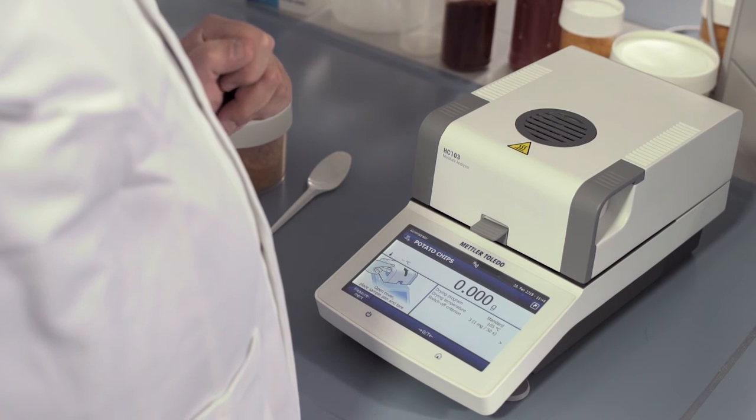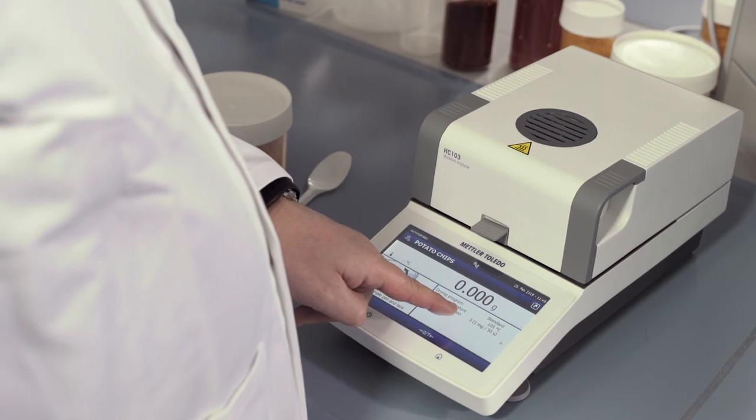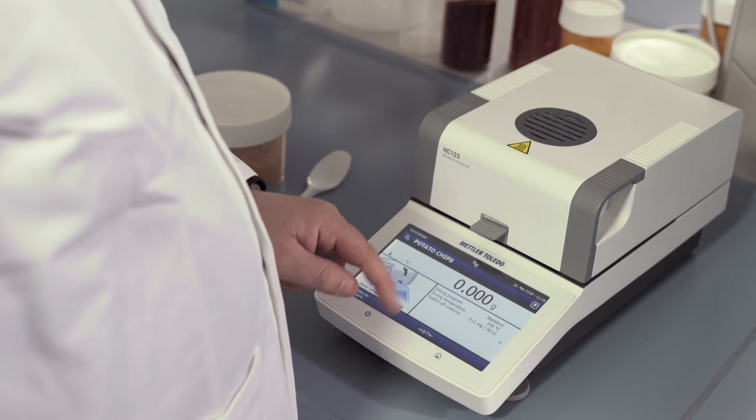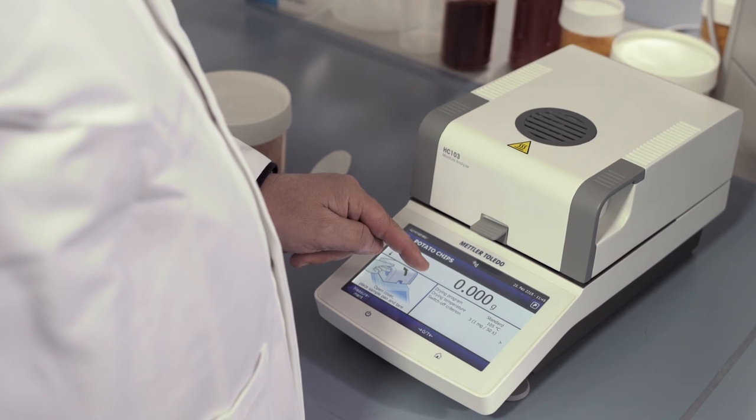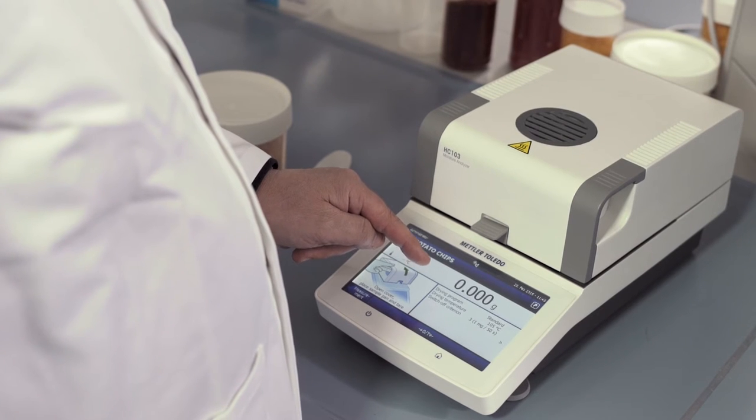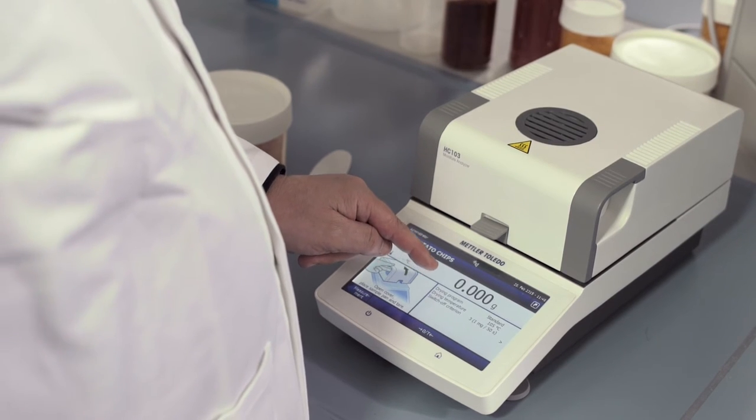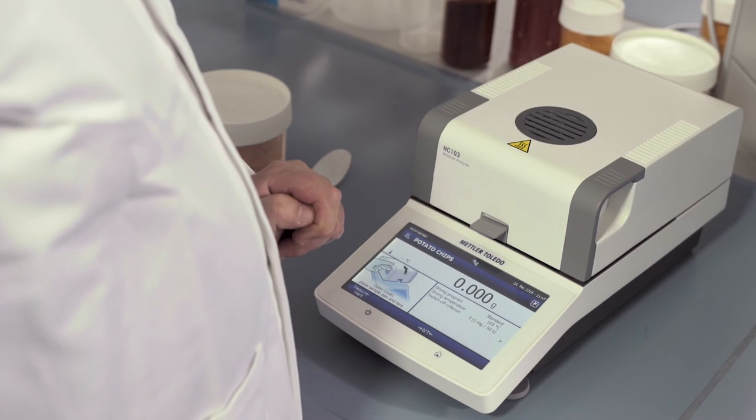On the right of the terminal screen, you can see the active measurement parameters: 105 degrees drying temperature, standard drying program, and automatic switch-off criterion.